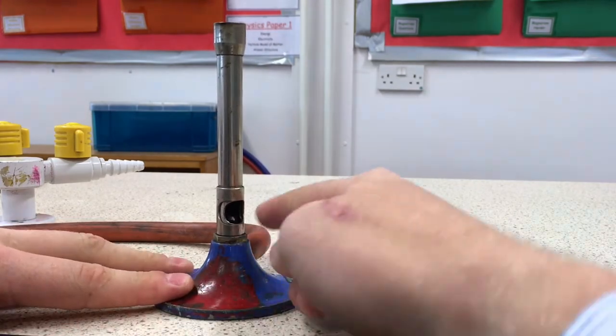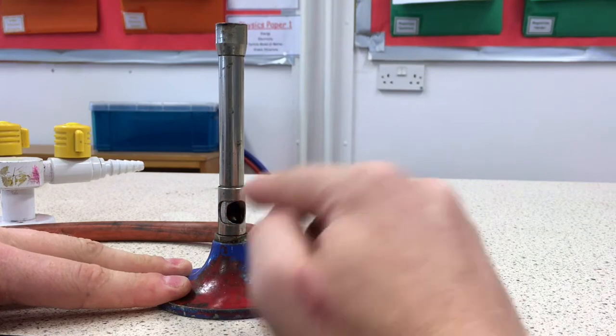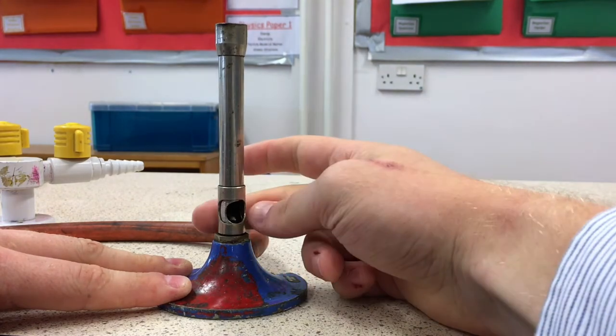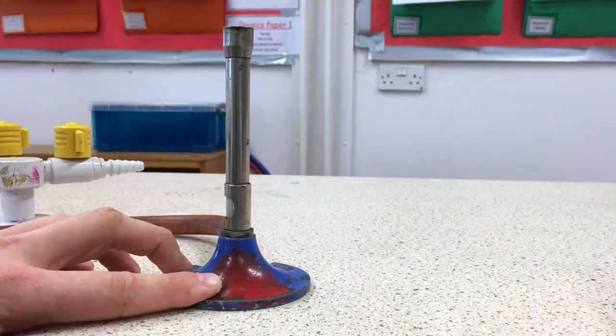The collar rotates around this hole, and that allows air into the Bunsen burner to mix with the gas and burn. To light a Bunsen burner we must make sure that hole is closed. Remember: ABC — always be closed.